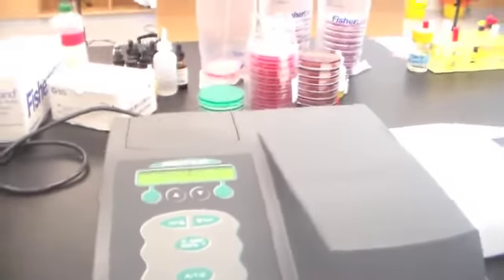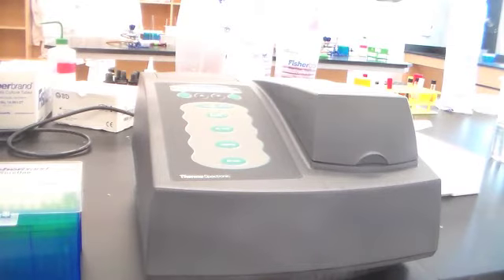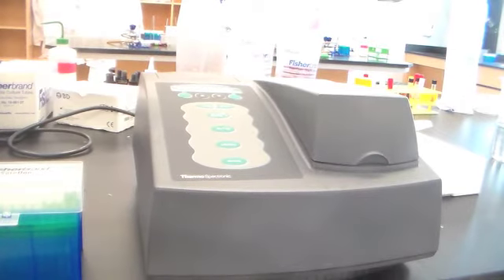So the principle here is that the more bacteria there are in that broth, the less light will pass through. More light will be absorbed. The bacteria absorb the light, they scatter the light, and as these absorbance numbers get higher, that's an indication that the bacterial culture is more dense. It has more bacteria per mil. So that's one way to determine how many bacteria there are per milliliter in a culture. You're actually going to establish an equivalency. You're going to calculate how many bacteria per mil it is for each one of these absorbances.